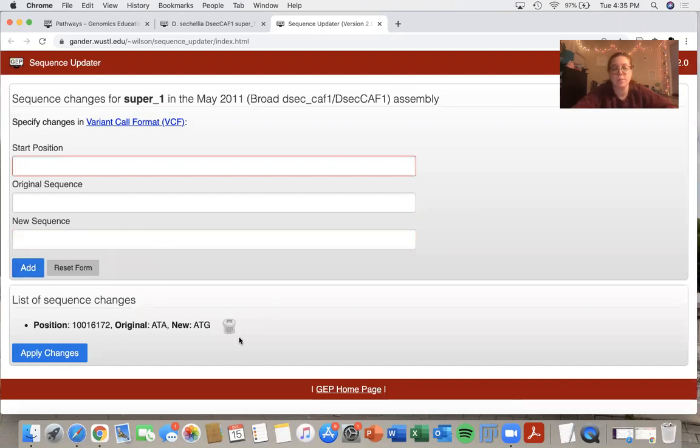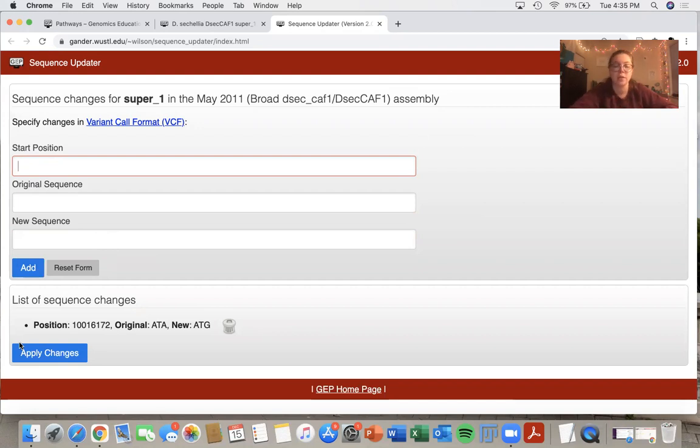So then it comes down here at the bottom, we have our list of sequence changes. So you can add more than one and I will show you how to do that as well.